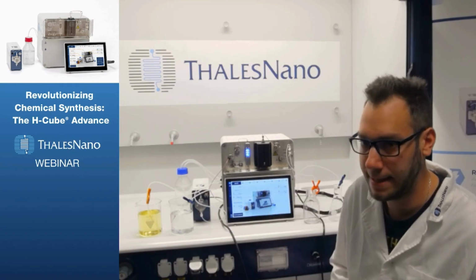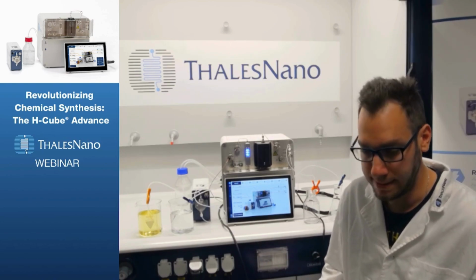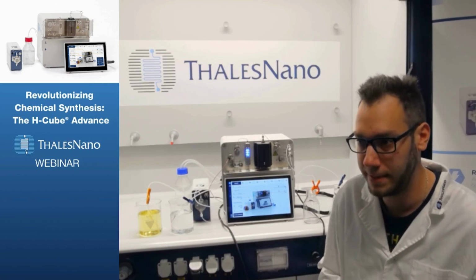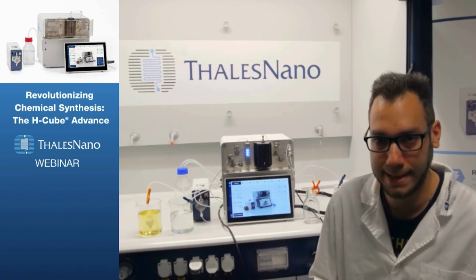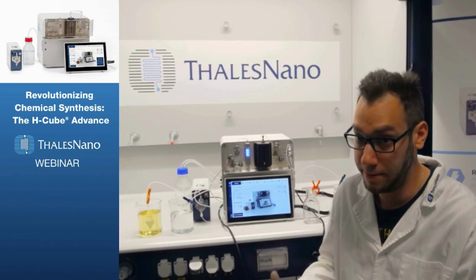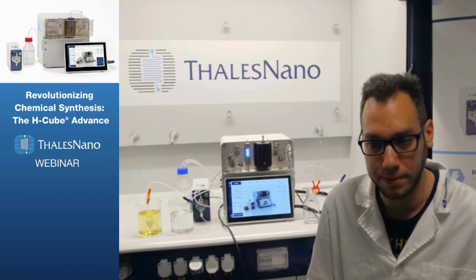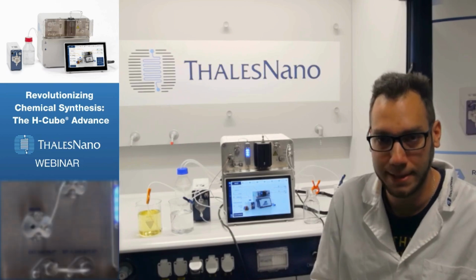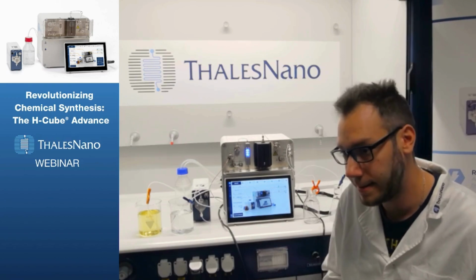So the electrolysis cell is located inside of the instrument. It's got an integrated water pump as well that's responsible for the constant fresh water supply of the cell. And once you start the instrument, you get an option to select between the internal hydrogen generation that will start the cell and the water pump, or the use of any external gases, which just uses the mass flow controller, and you can use the connections on the front panel tubing as well to connect a separate gas source. If you do that, the cell and the water pump don't start.